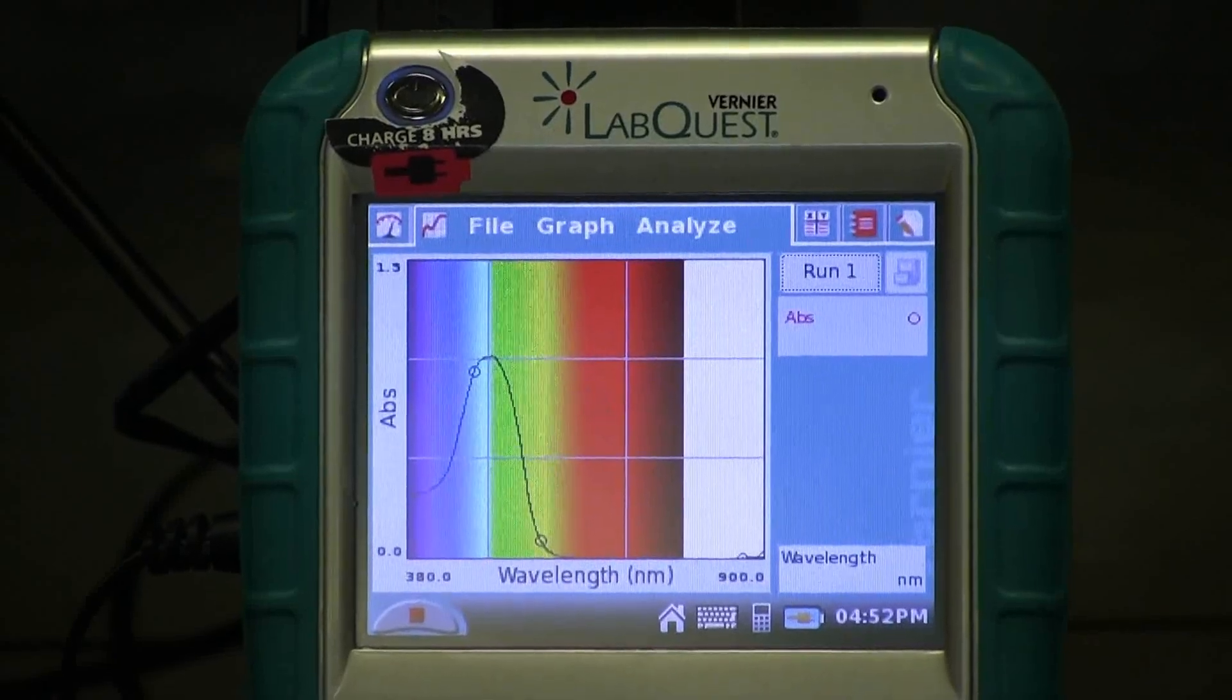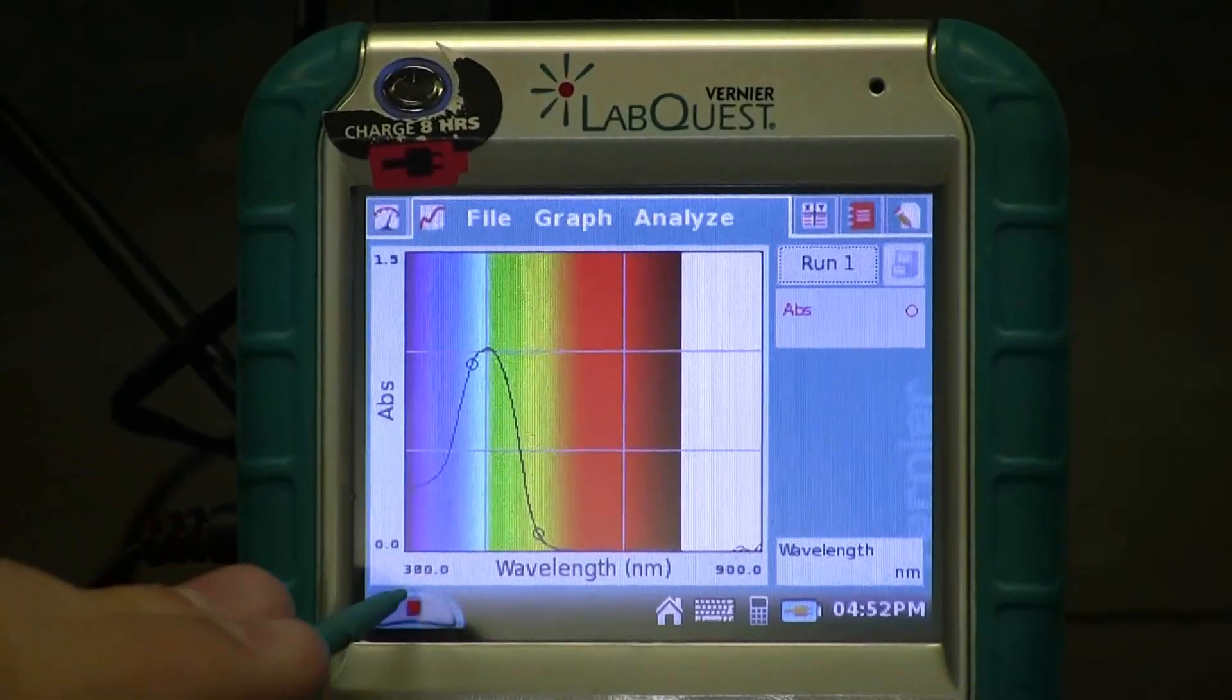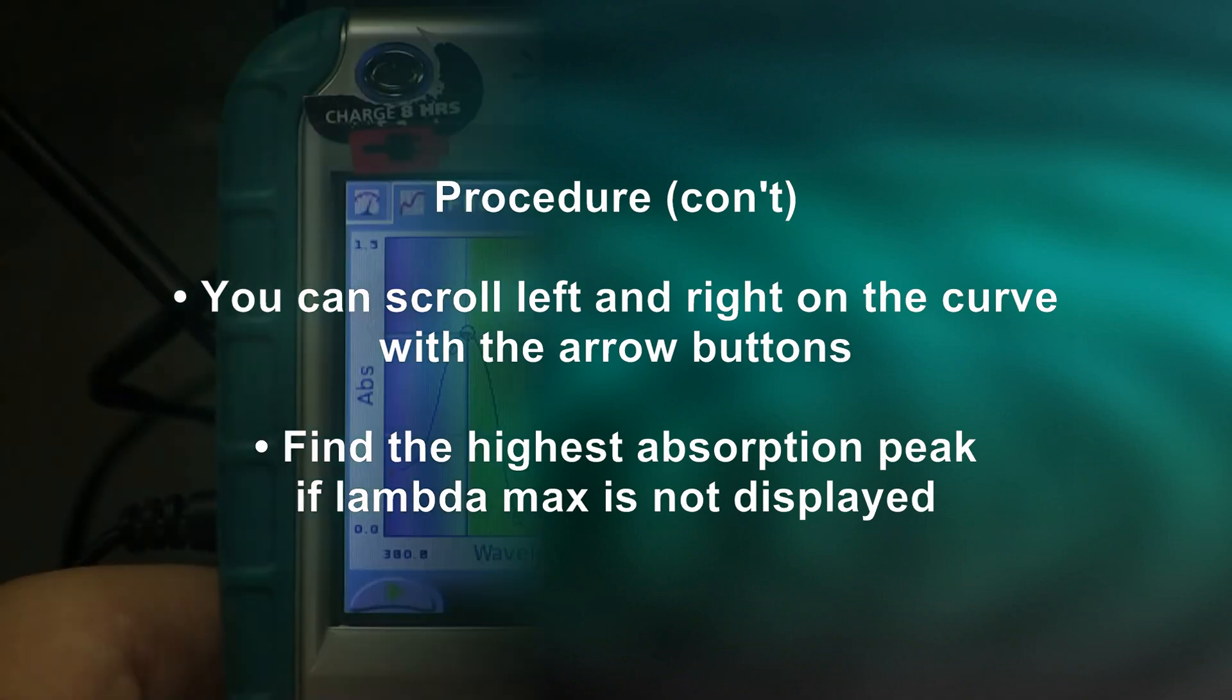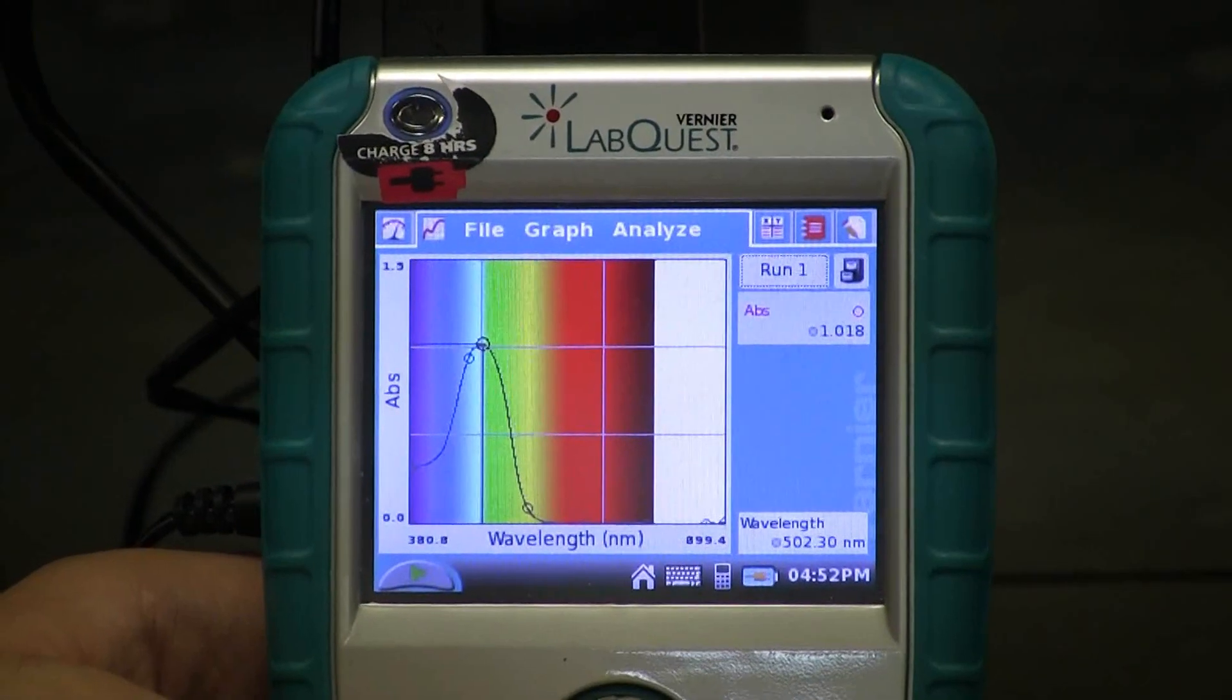After a few seconds, click Stop. The lambda max will be displayed in the bottom right-hand corner.